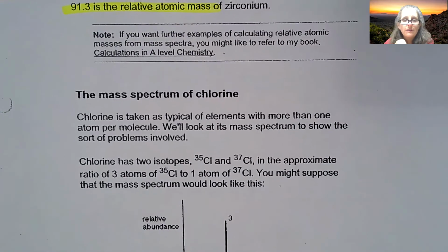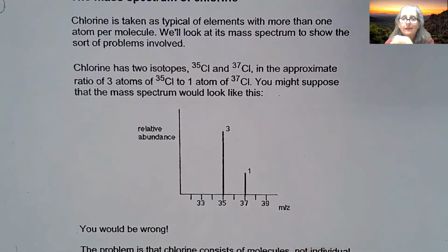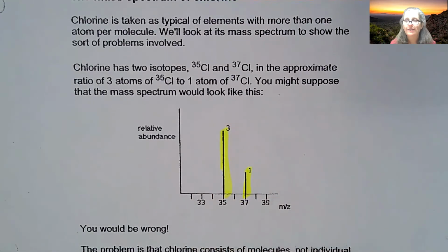Now, one other thing I do want to mention, organic chemists also use this technique for different things. It's used to chop up organic molecules, long carbon chains. But one thing I do want to mention is the height of the peaks is going to be proportional to the percentage of each one of those isotopes.